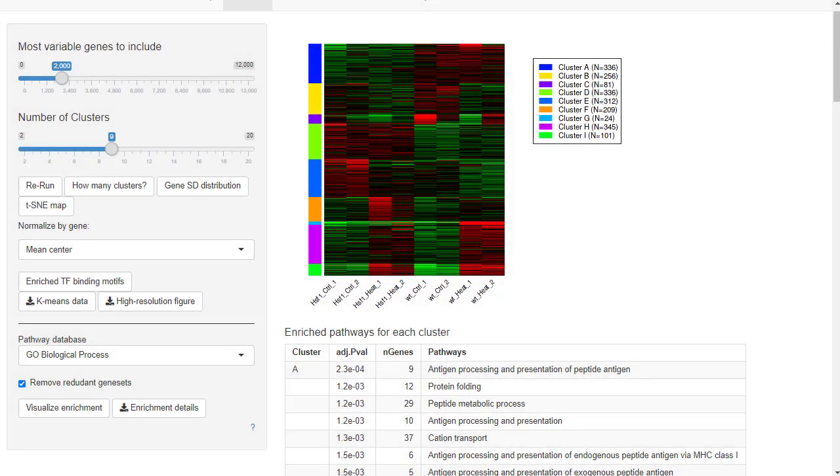This is a very convenient way of getting an overview. As you can see with the k-means clustering, we started to look into the different groups and the biological themes and functions of the genes there. With this kind of exploratory analysis, we can look at the things that we are expecting for this group of genes. I'm not sure what is going on behind this, but the exploratory analysis could help us identify unexpected findings. This will also form the foundation for differential gene expression, enrichment and pathway analysis.